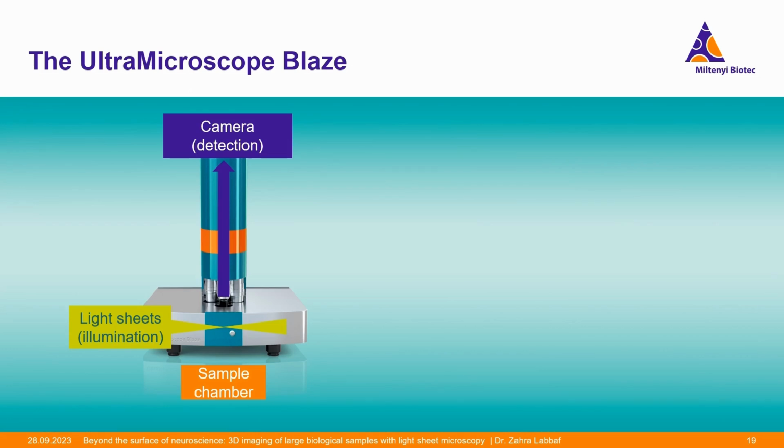In this microscope, samples are illuminated from the side using focused light sheets, and the emitted fluorescent light is detected by a camera that is located perpendicular to the illumination path. So the illumination and detection paths are separated.